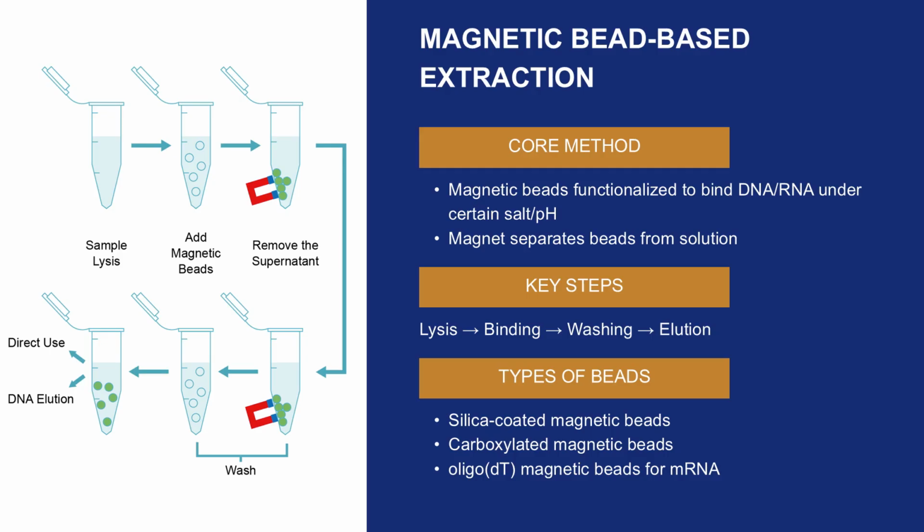By using a magnet, the beads and bound nucleic acids are easily separated from contaminants. The process is highly adaptable, allowing automation and consistent results. Let's explore why this method is gaining popularity.